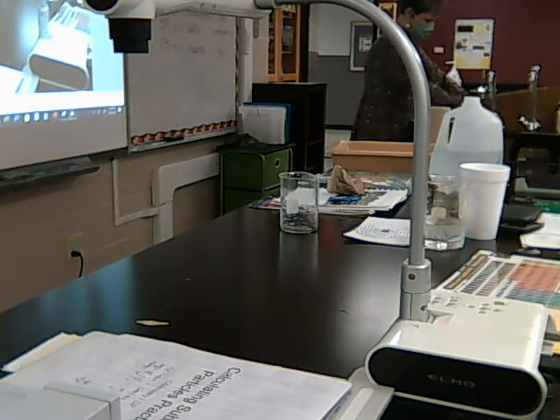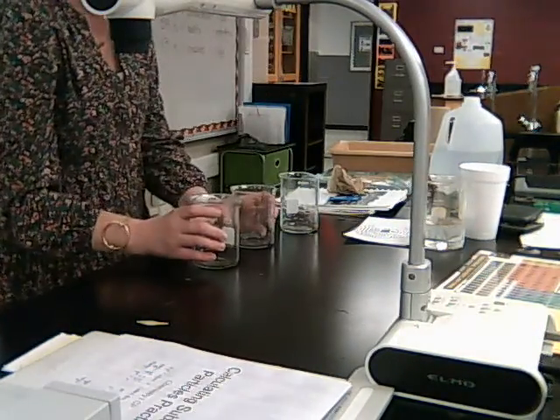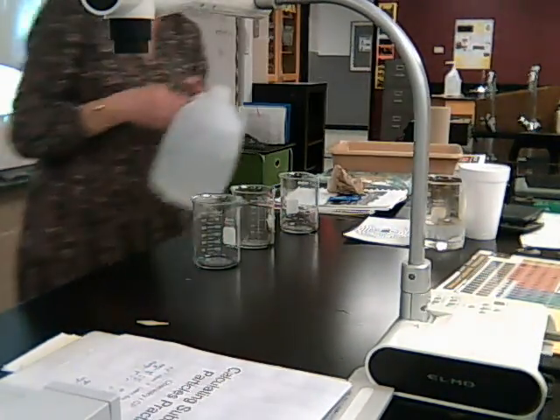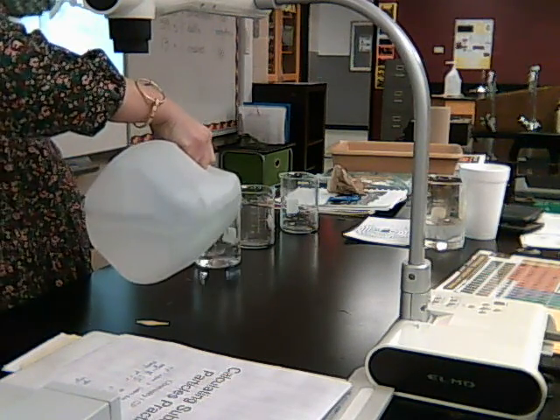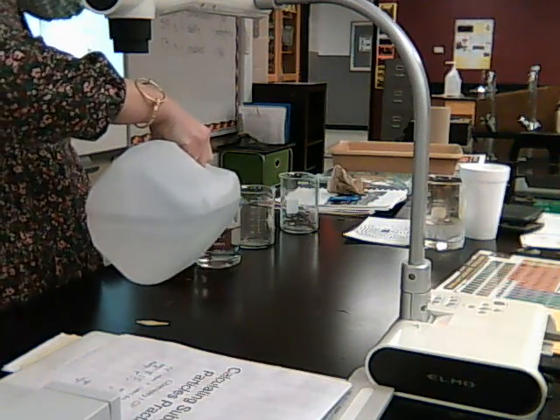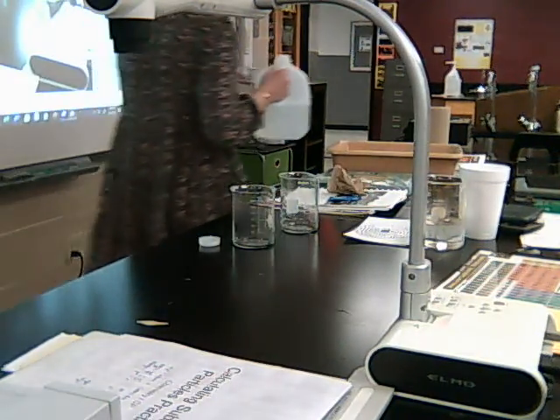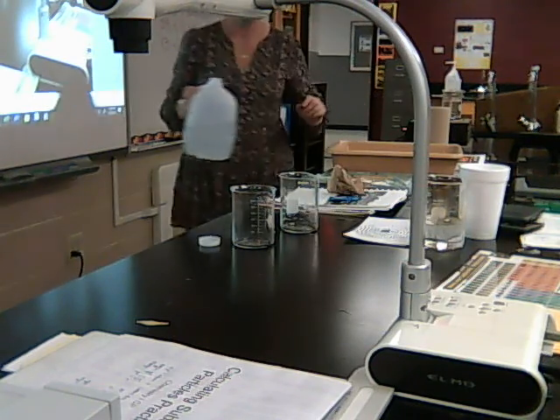I'm going to rinse out all my beakers. Try to get them as clean as possible. They probably aren't as clean as they could be, but I'm going to try the same thing again. Hopefully I won't make as big of a mess this time.